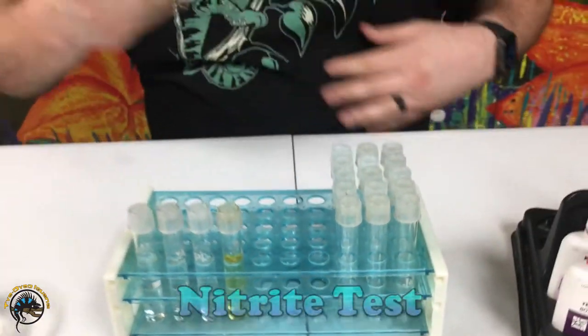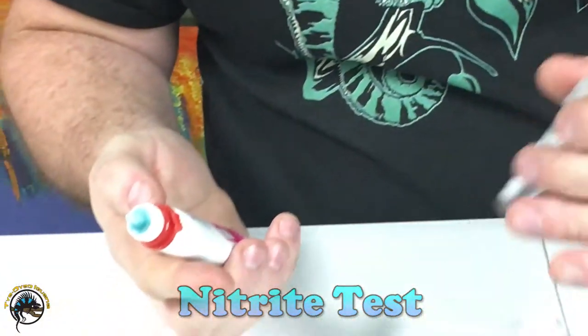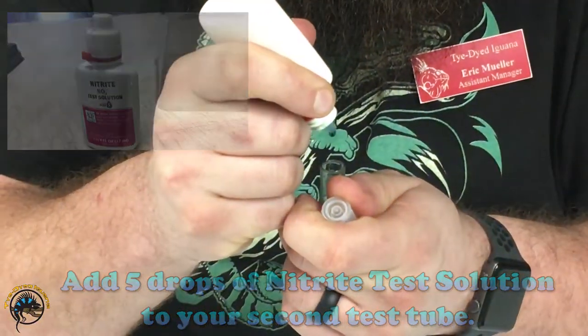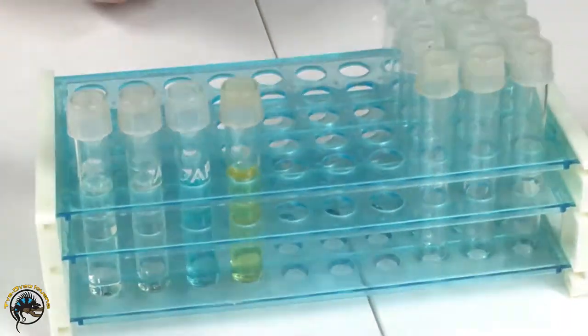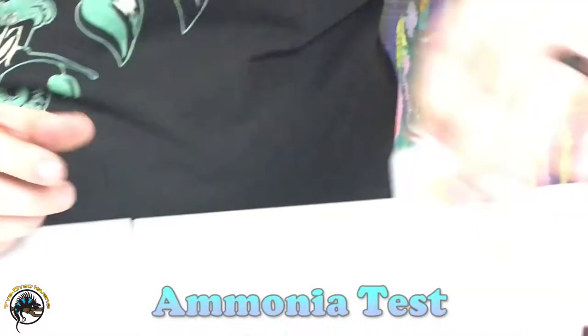The next one I'm going to use is the nitrite test kit. This one's five drops. Just invert that a couple times too.